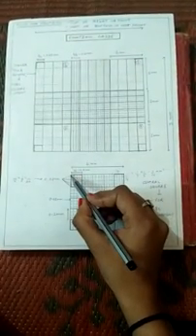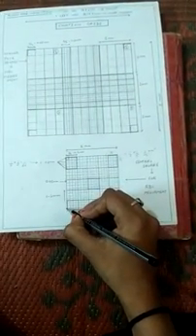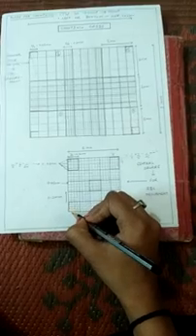So friends, you can see that this is the length of one small square, 1 by 5, which is equal to 0.2 mm, and this is also the breadth of this small sub square. So the area of this whole small square will be 0.04 mm square. Friends, if we assume that this will be 0.2 mm, then this will also be 0.2 mm. So the area of this whole small square will be 0.04 mm square.